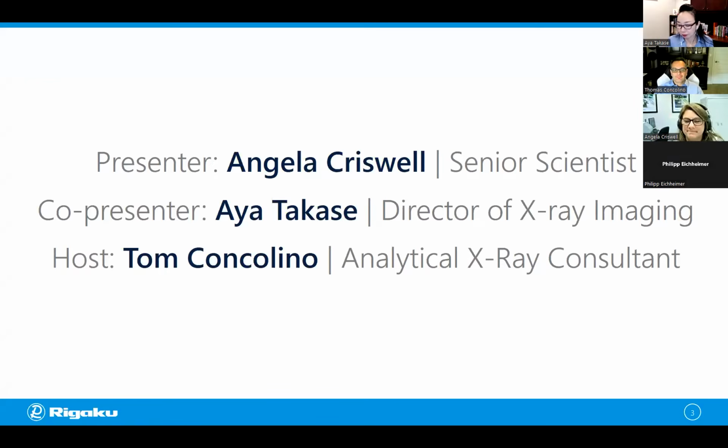Hi, everyone. Thank you all for attending Rigaku's workshop series on X-ray computed tomography for materials and life science. This workshop will be the second in our deep dive series covering filtration analysis, and will focus on segmentation and properties. This session will be taking place in the lab, with Angela and I reviewing in real time how to deal with the unique challenges of performing CT experiments on filter media samples.